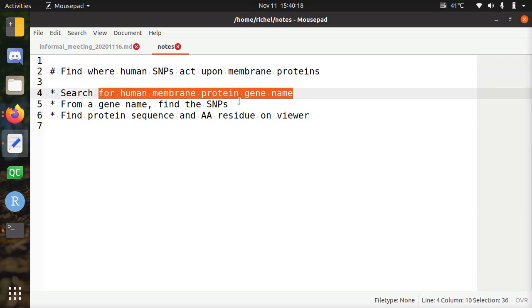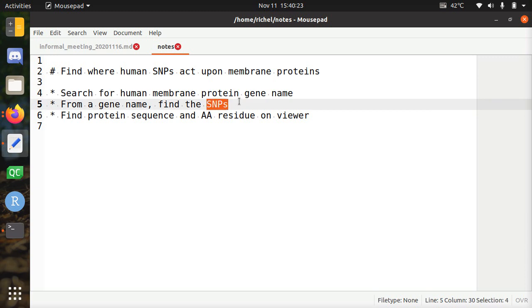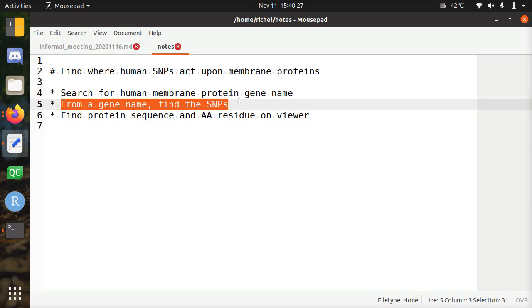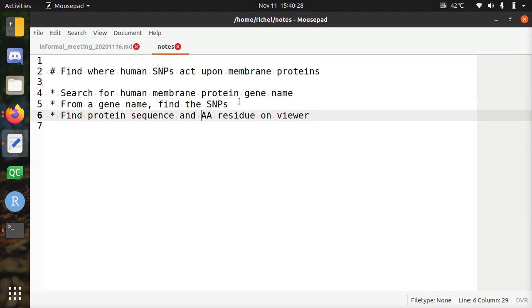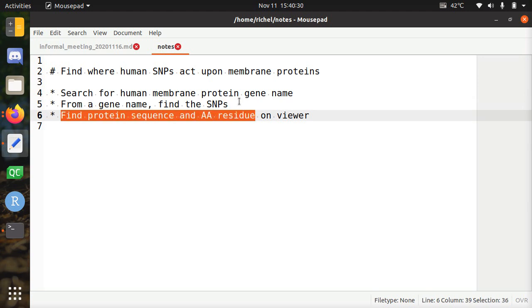First you need to find the gene name of a human membrane protein. From that gene name you can find the SNPs. And then there's a viewer where you can see the SNPs in the genomic context, and there you can find which amino acid the SNP acts upon. And you can download the amino acid sequence of the protein.